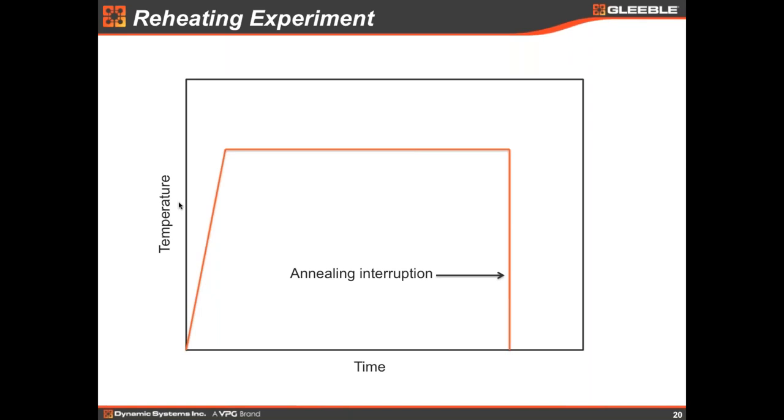And at the end, what do you want to know? You want to know the grain size. You want to know if the alloying elements went into solution, so that they play their role during hot rolling. And so this is the basic idea. And of course, you want to see if you get rid of the precipitates that are eventually there, and you want to dissolve those precipitates.